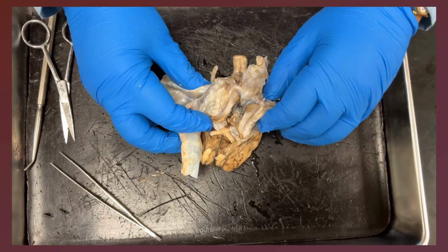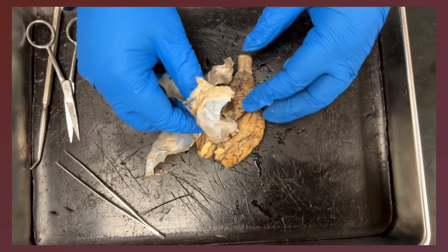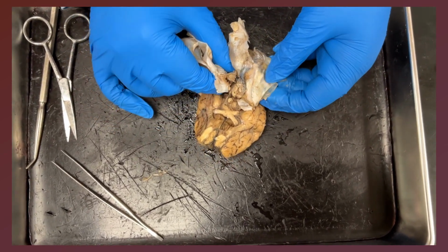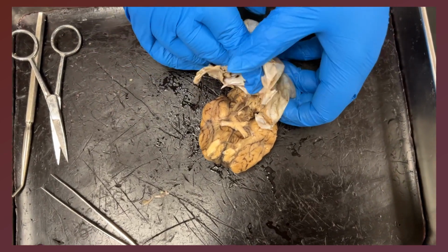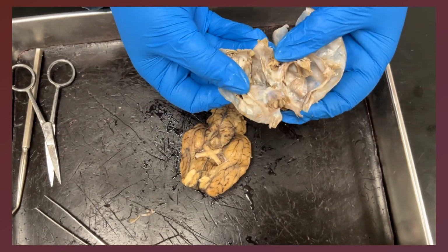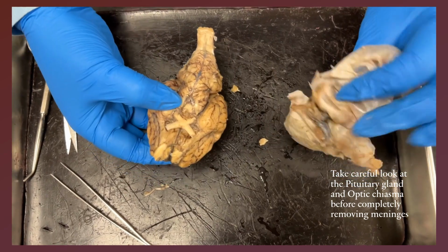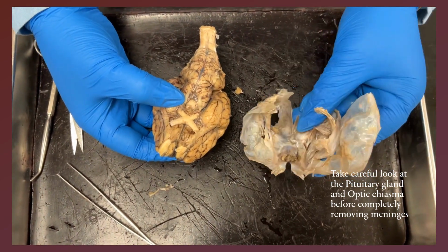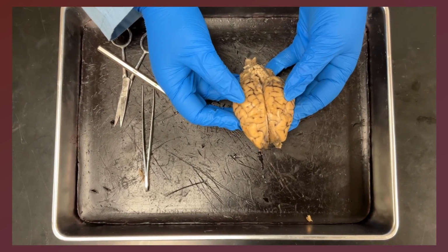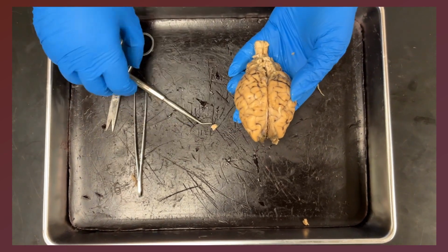So I have carefully removed the dura mater from all around. This is the last part I wanted to show you. See, when we remove the meninges completely, now there is no way to save the pituitary gland to keep over there. This is the inferior view, and this is the whole meninges. Let's go over the external view with different regions of the brain.